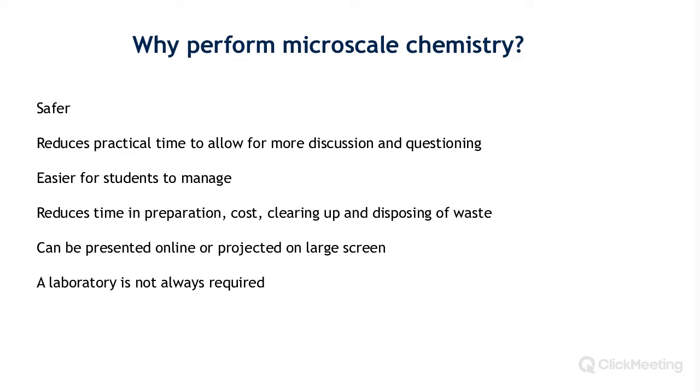reduced. When I first started teaching science, I tended to underestimate how long it took to do a practical lesson. When you think about the time it takes to give out instructions, fetch a test tube rack, put the test tubes in the rack, add the chemicals and distribute the chemicals, then the pupils analyze and record the results, and then they have to rinse and clean the test tubes and then put them back. This was all very time consuming.